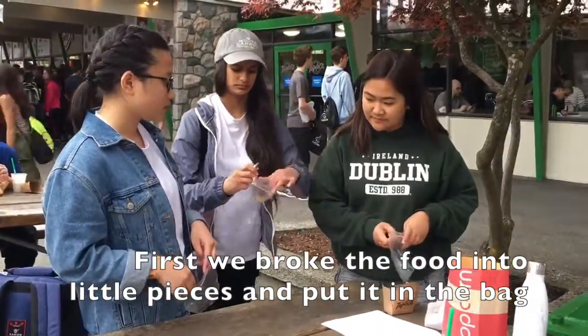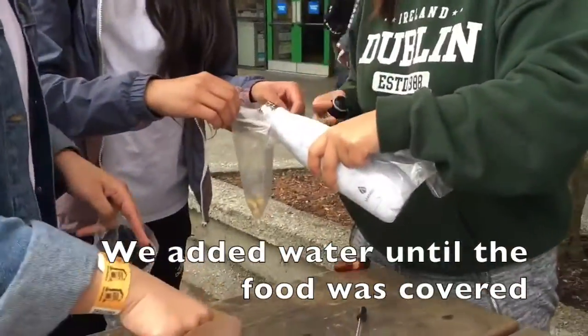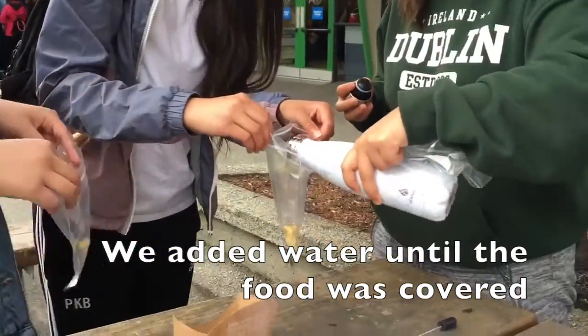First, we broke the food into little pieces and put it in the bags. We added water until the food was covered.